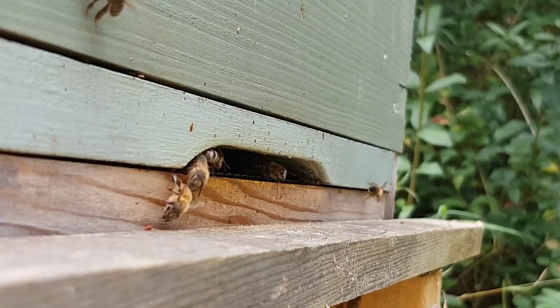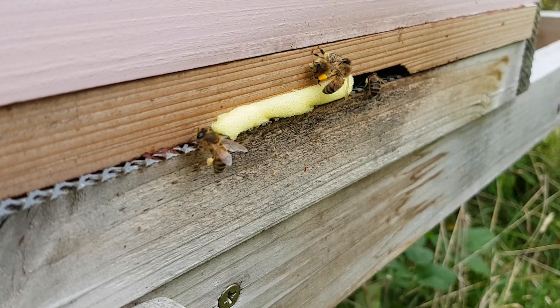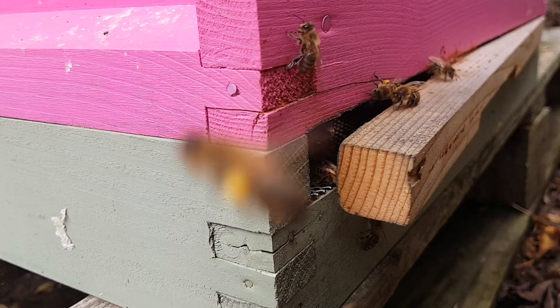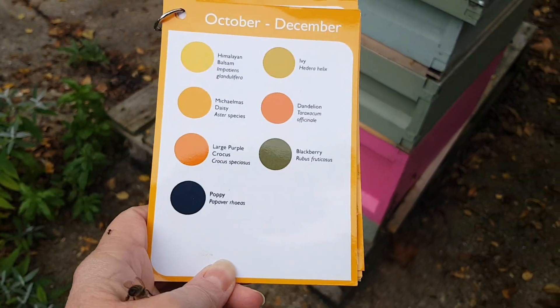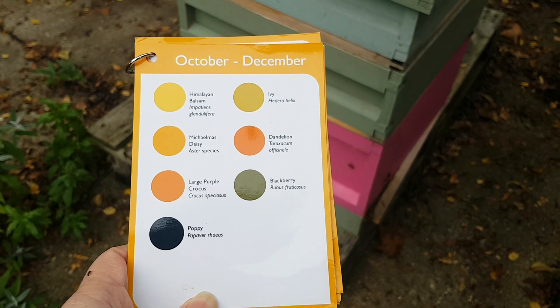So how can you be sure what you think you see coming in on your bees is actually any of these plants? You may be seeing a yellow pollen, this sort of colour on your bee, and you may be thinking that's Himalayan balsam, when in actual fact it's not.